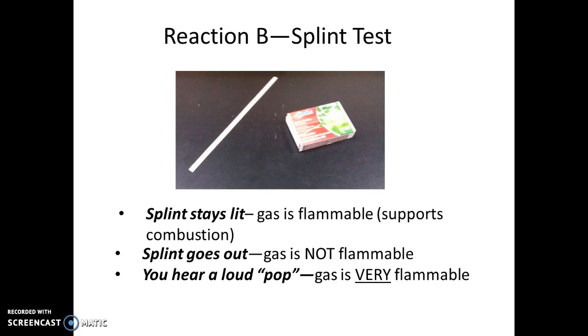So you'll do a splint test as an additional observation for the gas in reaction B. When you're all done with reaction B, you can rinse the contents from that test tube down the drain.